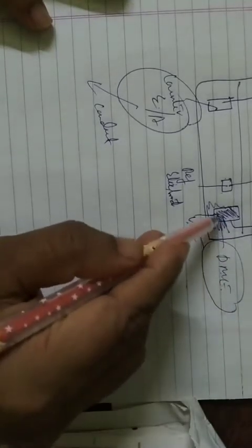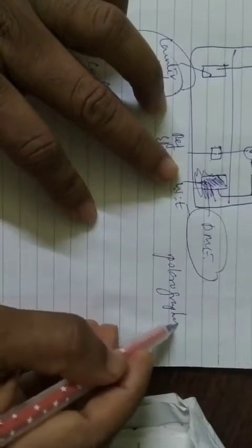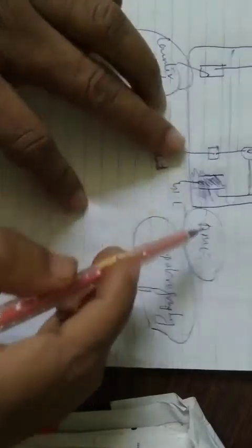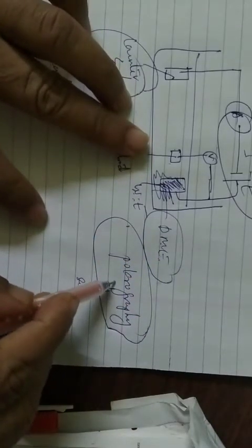When this working electrode is made up of DME, what is DME? DME is the dropping mercury electrode. If you take the working electrode as a dropping mercury electrode, then that voltammetry is called polarography. In the second semester I think you have learned polarography in studying the stability of metal complexes. So if you take the working electrode as a dropping mercury electrode, that voltammetry method is called polarography. This is how the basics of voltammetry start.